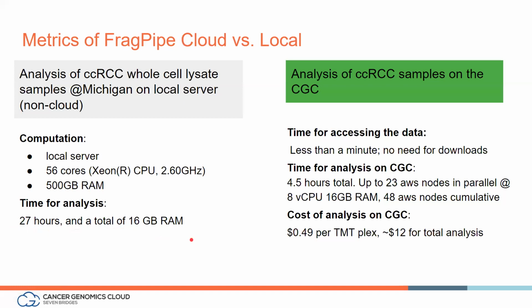That's actually already something pretty impressive, because most of the pipelines or other tools that are available right now cannot reach those results in that amount of time. And the analysis that David and I are going to show you uses the same data, but it's much faster.